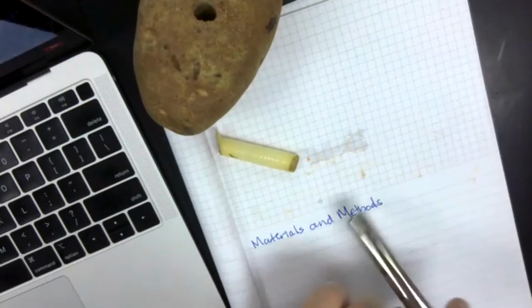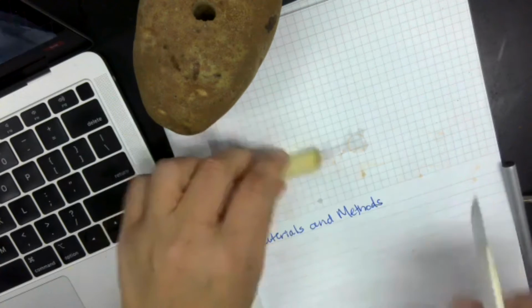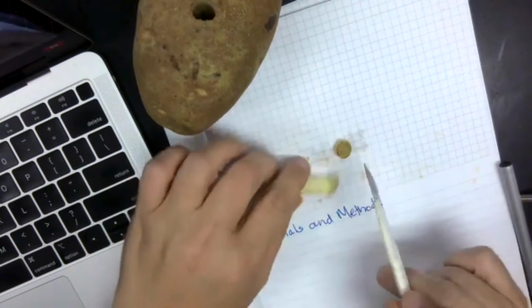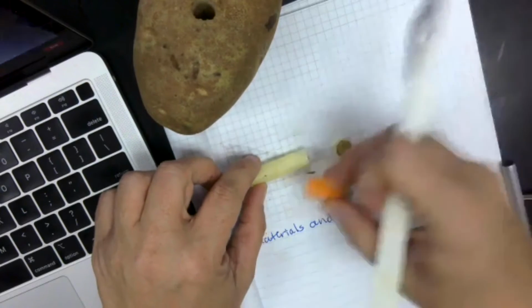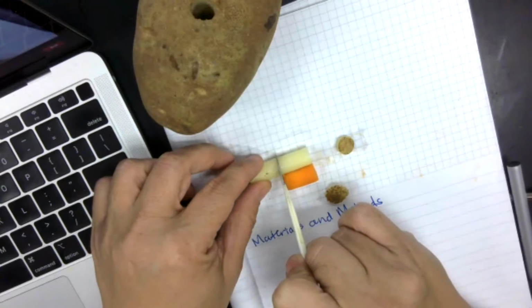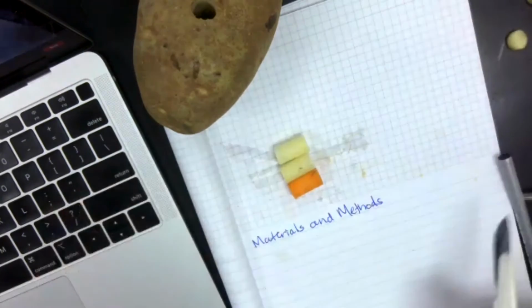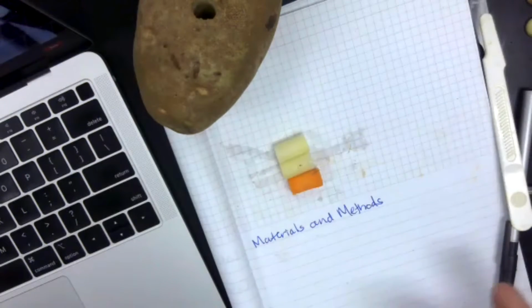Now, what I'm going to suggest is that you take your scalpel and cut the skin off a vegetable if it has skin. Then try as much as possible to make these around the same size. It doesn't have to be perfect. This one seems nice, like if I just cut it in half, they're all going to be about the same size, and that's good. It's not critical because we're going to weigh these. So that's the coring process.